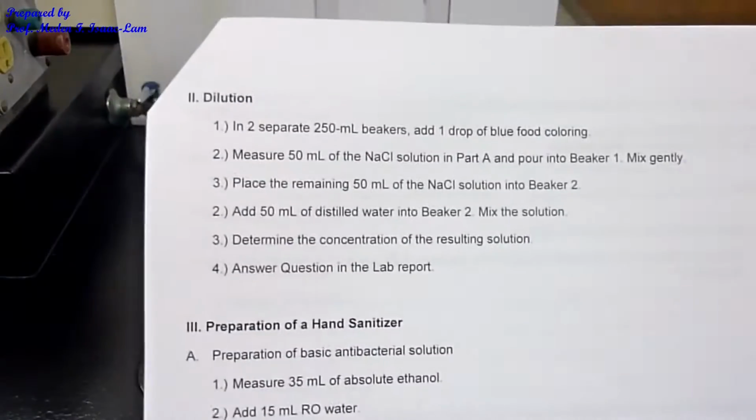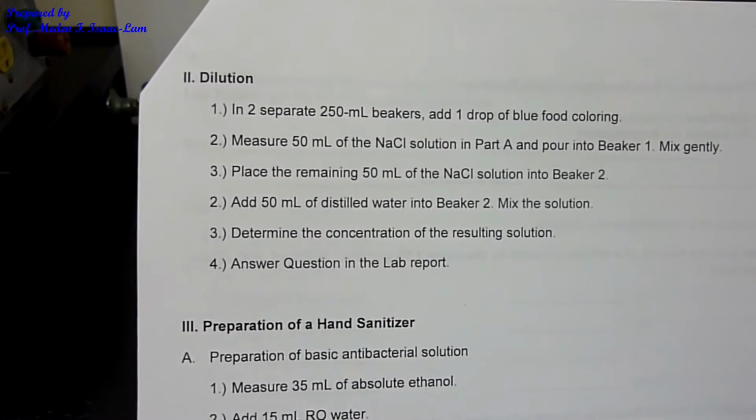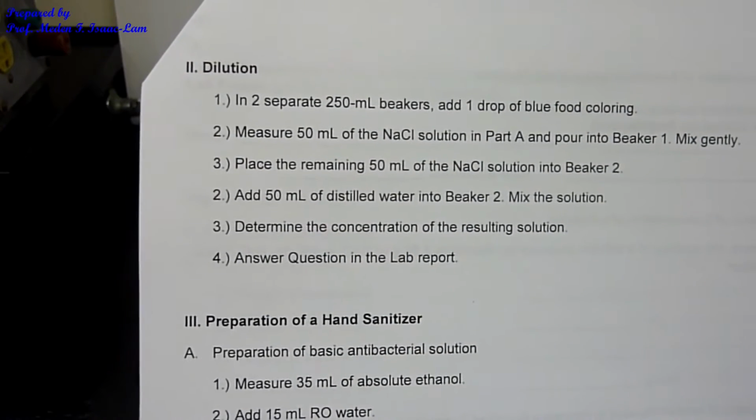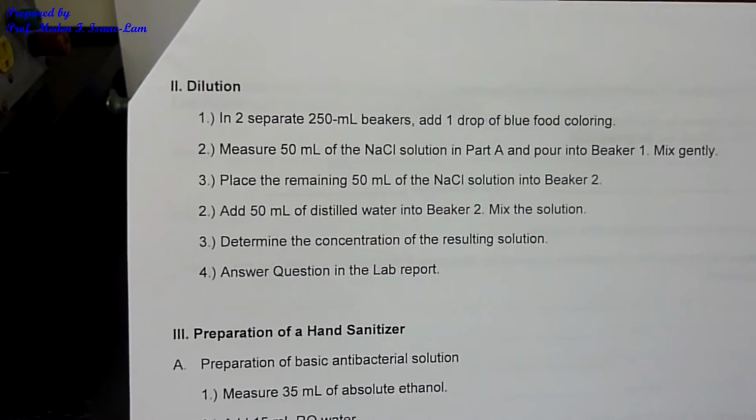We're now doing part 2, which is the dilution. So I'm going to illustrate how to dilute a solution. And we're just using the solution that we made in part A, which is the sodium chloride solution.